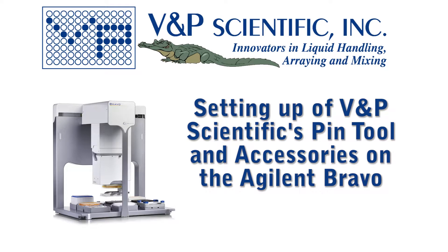The purpose of this video is to demonstrate a standard pin tool configuration, including all wash accessories, on an Agilent Bravo.